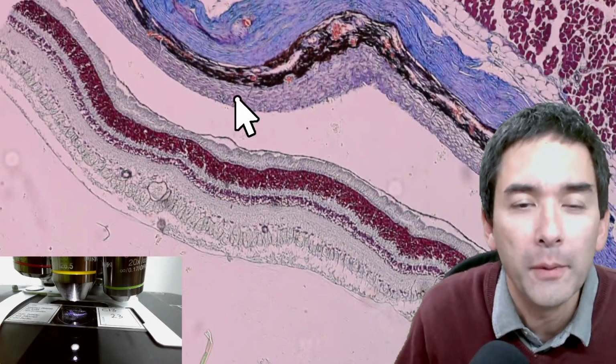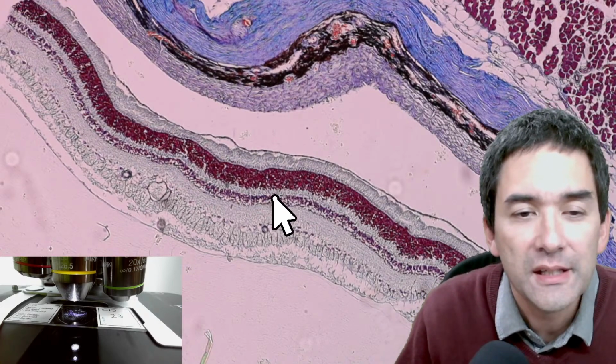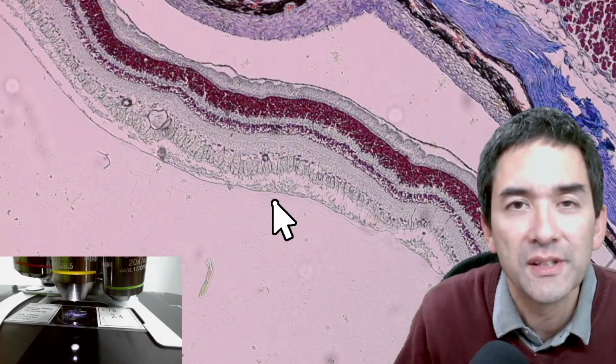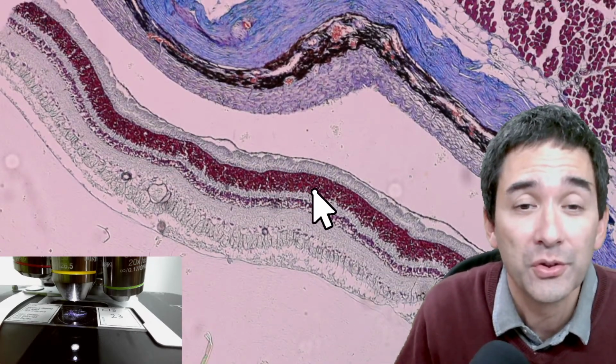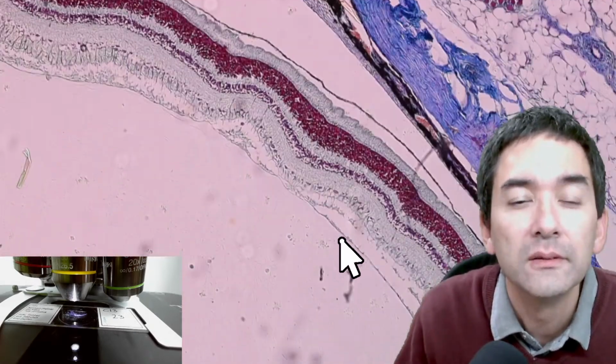quite cheaply. And when you cut them open, you're going to see that the inside is completely black. The reason is that you do not want to have any light bouncing around. So for example, also the inside of a cinema, if you go to a cinema, you are also going to see that the walls generally are quite dark because this increases the contrast.